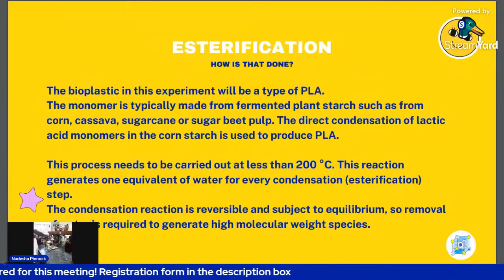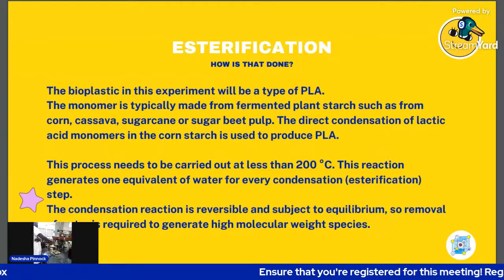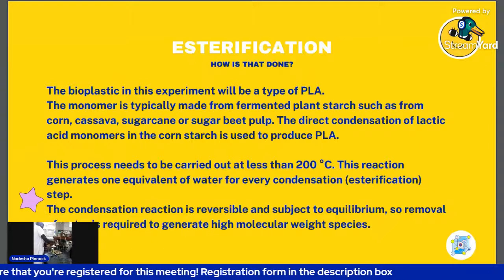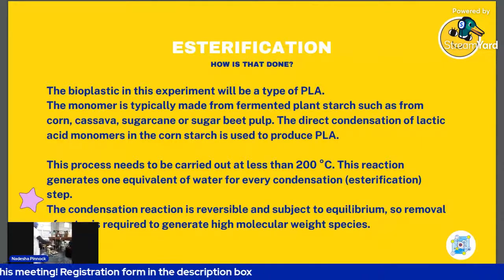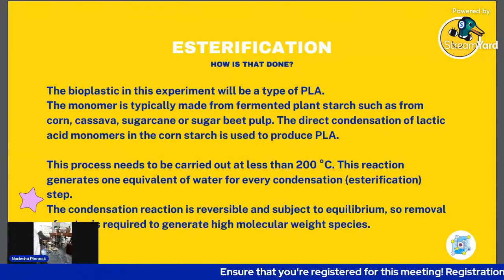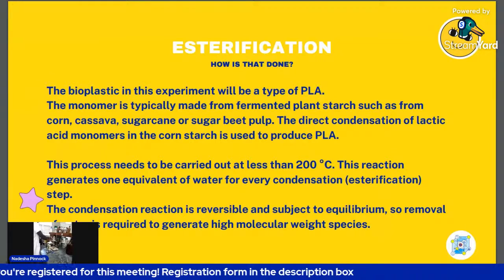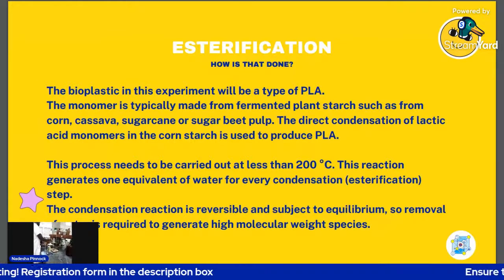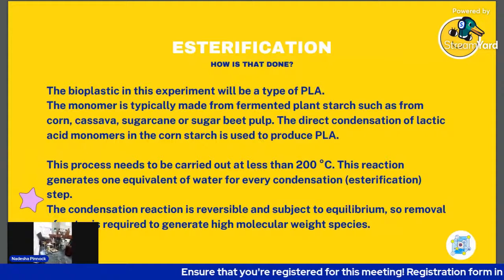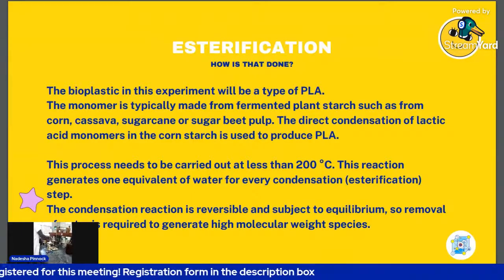So the process, how does it work? What really happens? In our experiment that we're doing now, we're making a polylactic acid, which would mean that we're using some lactic acid, right? A PLA. So the monomer, which means a single unit, is typically made from fermented plant starch, such as corn, cassava, sugarcane, or sugar beet pulp. When you conduct a direct condensation of lactic acid monomers in the cornstarch, you are able to produce PLA, which is essentially what we are doing.